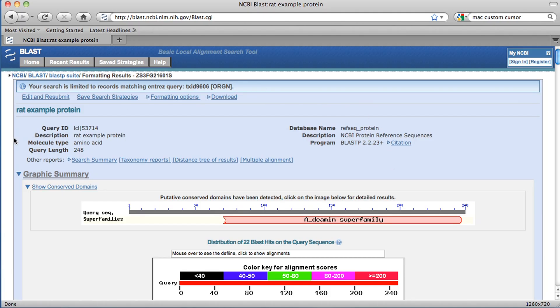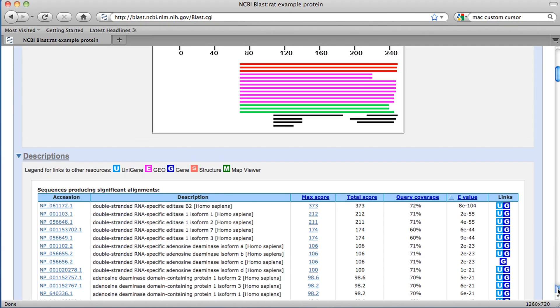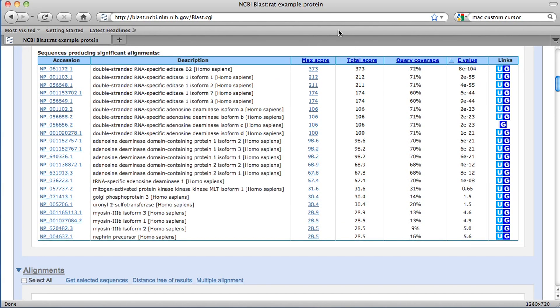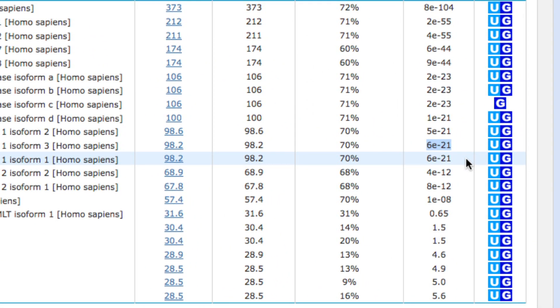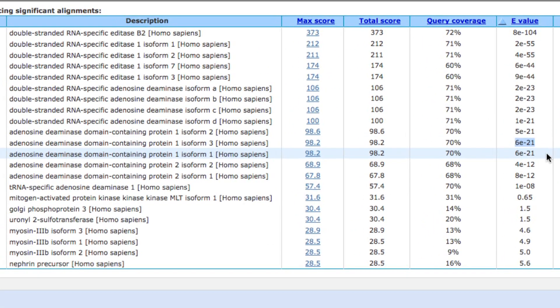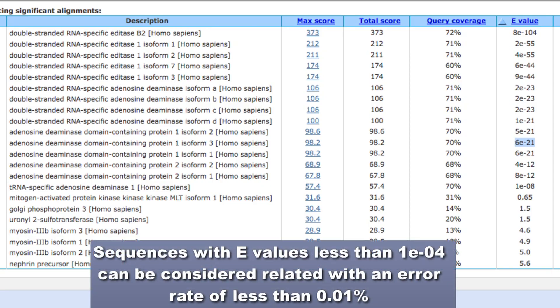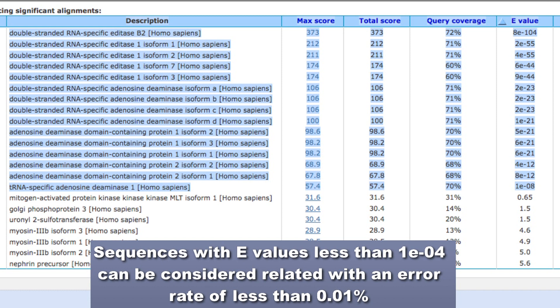You have some basic parameters here at the very top, along with a graphical view below that. The hits are sorted by total score from highest to lowest, but also by E or expect value from lowest to highest. The 6e-21 on this line means 6 times 10 to the minus 21st. What we're looking for is a very, very low E-value. Anything below 1 times 10 to the minus 4th can be considered homologous or related to the sequence that we started with. So essentially, all of the sequences highlighted are relatives of that rat sequence in the human genome.